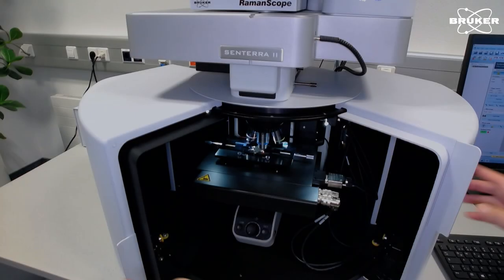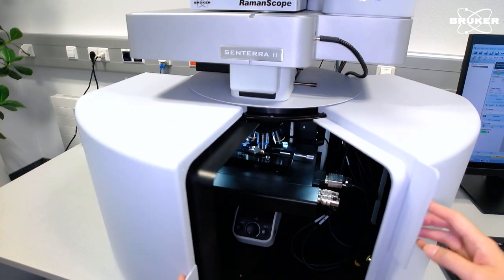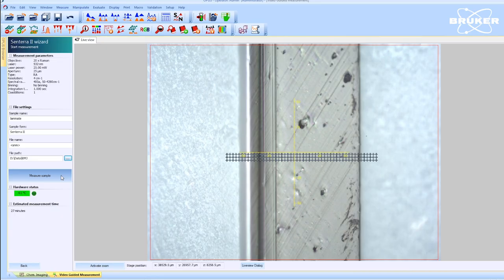As soon as we close the Sentera II's laser safety housing, the analysis can be started with a single click.